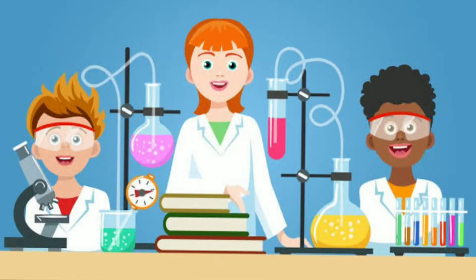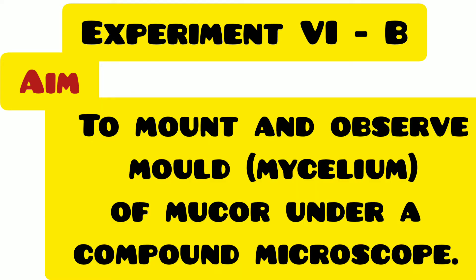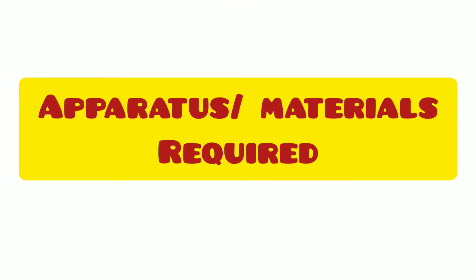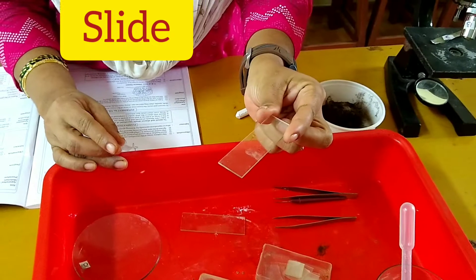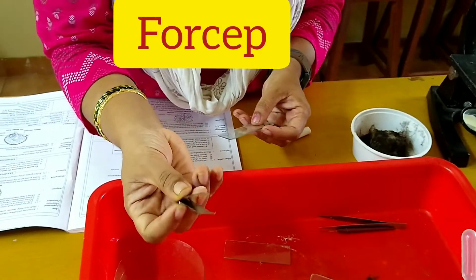Hi students. Today we are performing experiment 6B. The aim is to mount and observe mold of Mucor under a compound microscope. The other common name for the Mucor is bread mold. What you need is a slide, cover sleeve, and forcep.